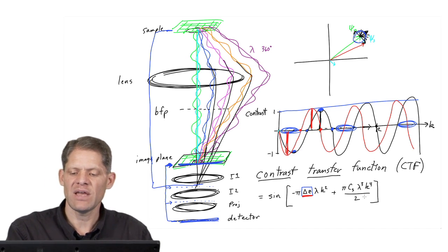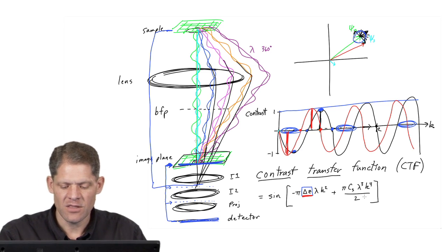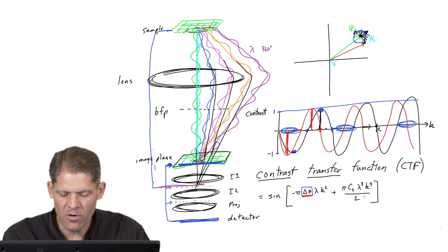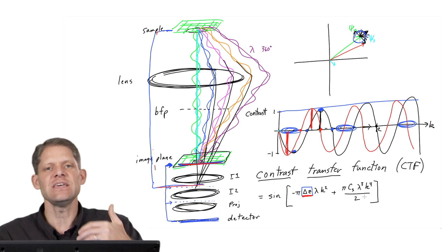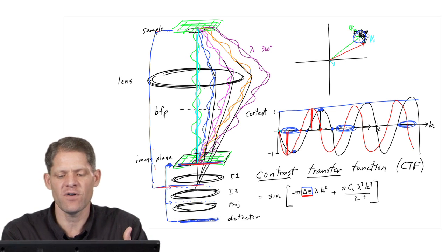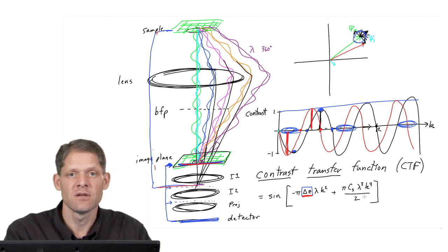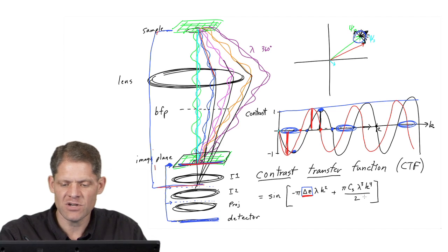Now, if you make the objective lens weaker so that the plane that's conjugate to the sample is now below the plane that's being imaged on the detector, we call that defocus, because the objective lens is too weak. It's defocused. On the other hand, if you dramatically increase the current in the objective lens, then all of these rays are going to be focused even more tightly.